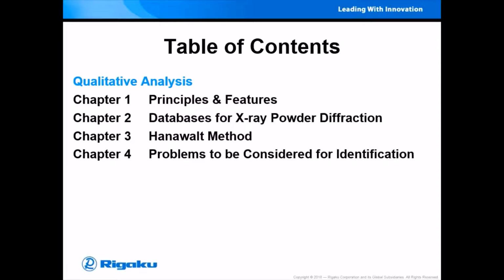This is a 4-part series about qualitative analysis of X-ray powder diffraction. I'll explain principles and features in Chapter 1. And I'll introduce databases used to identify composition of a sample in Chapter 2.